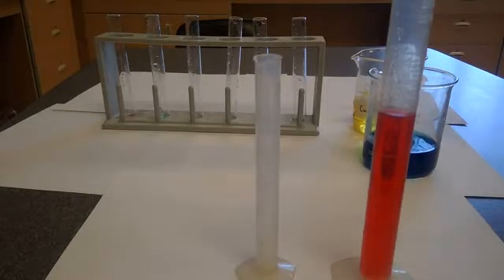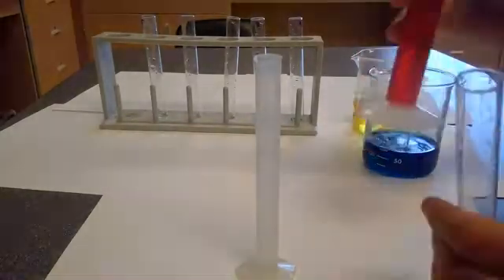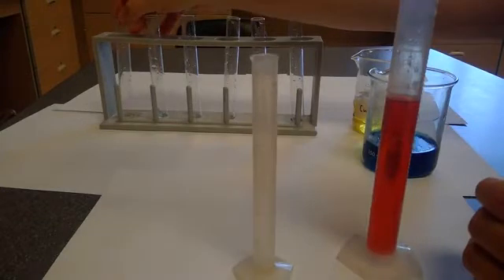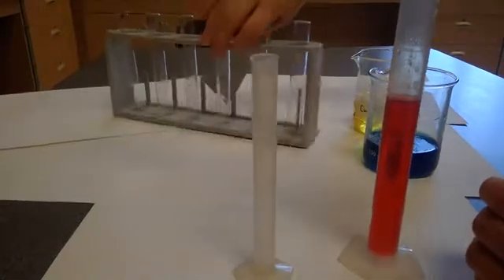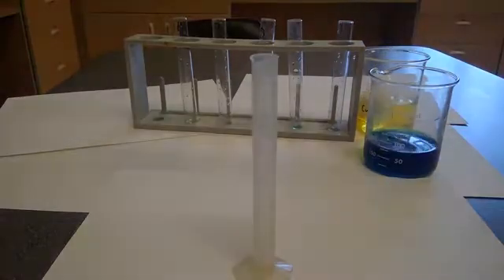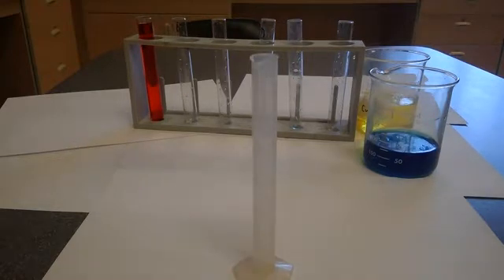That looks accurate. So now in test tube A, I'm going to go ahead and very carefully, sorry, let me turn my test tubes around. There we go. Test tube A, I'm going to go ahead and put all of this in. I have to be careful not to spill. Then I'm going to move on to the next step.